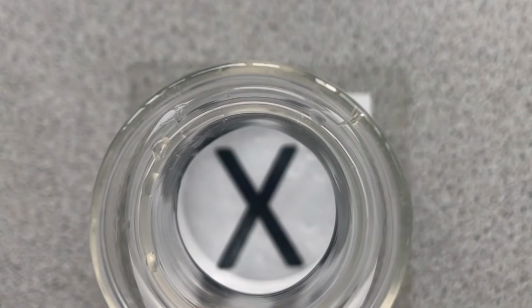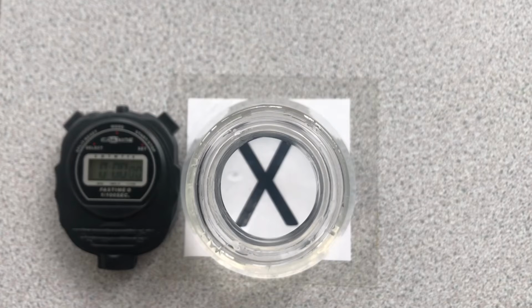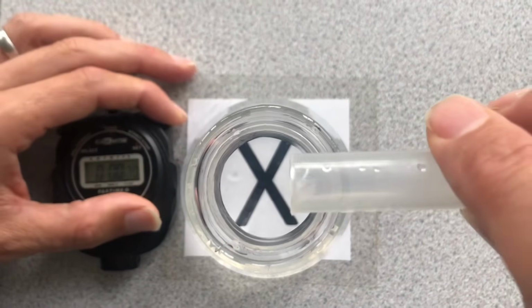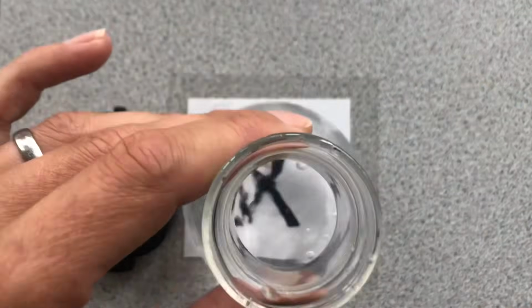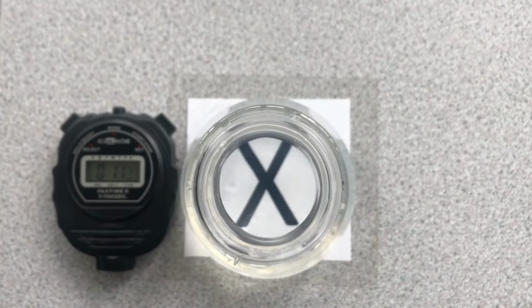Okay, and we're going to need a stopwatch to start that, so we can time it. Let's try and get that in focus. That's as good as I can get the focus, so we're ready to go. I've got my 50 centimetre cubed of sodium thiosulfate in there. I'm going to start the watch, and I'm going to tip in the acid and give it a swirl, and we'll try and keep it in focus. Now, the important thing is, now I've given that initial shake, I'm not going to shake it again, because obviously the more I shake it, the more collisions I make. And that wouldn't be a fair test. I'm going to shake them all the same. Every reaction is going to be shaken in the same way.